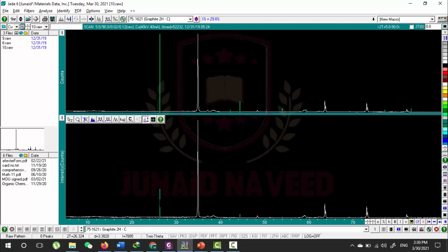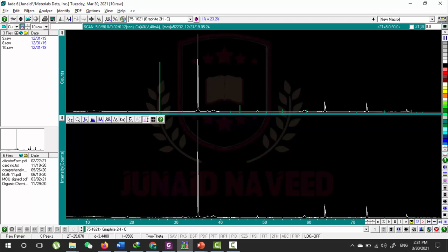In my zoom window, you can see I can increase or decrease this overlaid intensity which are obtained from the PDF file. Through this I can see more clearly my peak points of my pattern and where it is hitting to my main pattern.